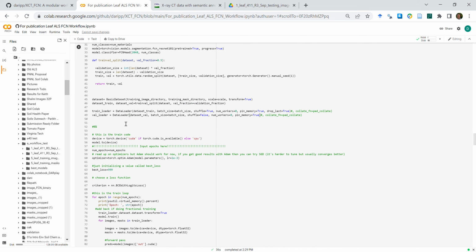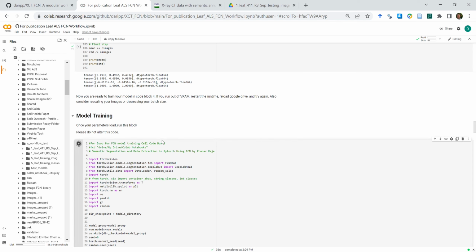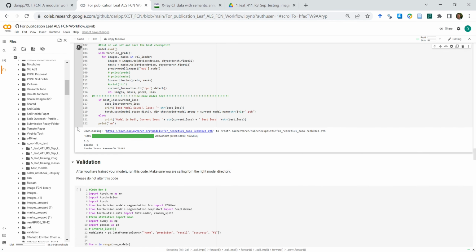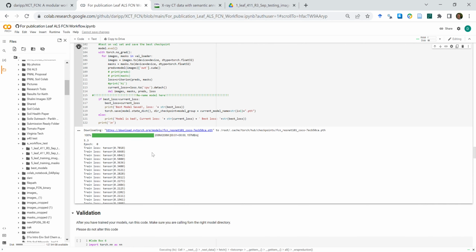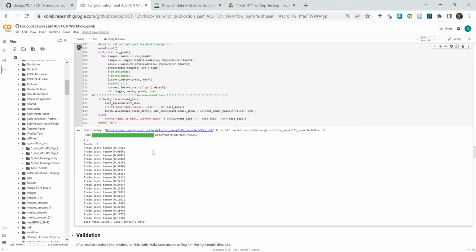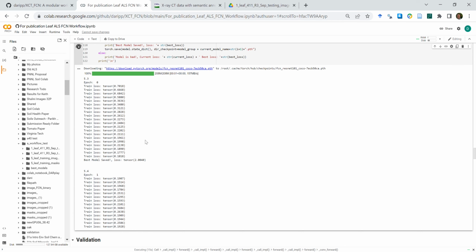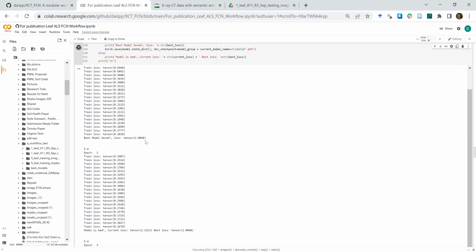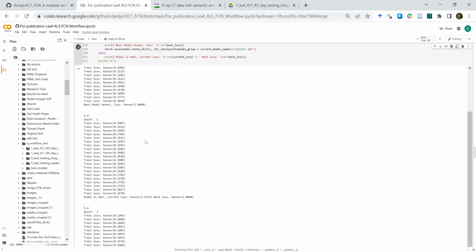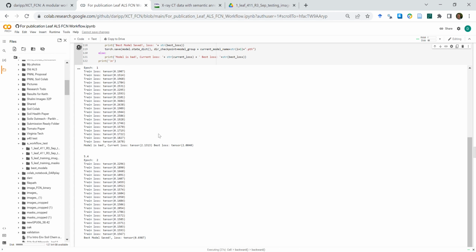And so now we're going to start training our model. In order to train the model, we're just going to run this code. And there we go. It should be off to the races right now. So it's starting to train. We're on an A100. This is a very fast video card, so training is going to get done very quickly. It is going to be 30 epochs. So this is probably going to take about 4 or 5 minutes. Feel free to fast forward through this part while it's just training up the model, and I will catch up with you when model training's done.